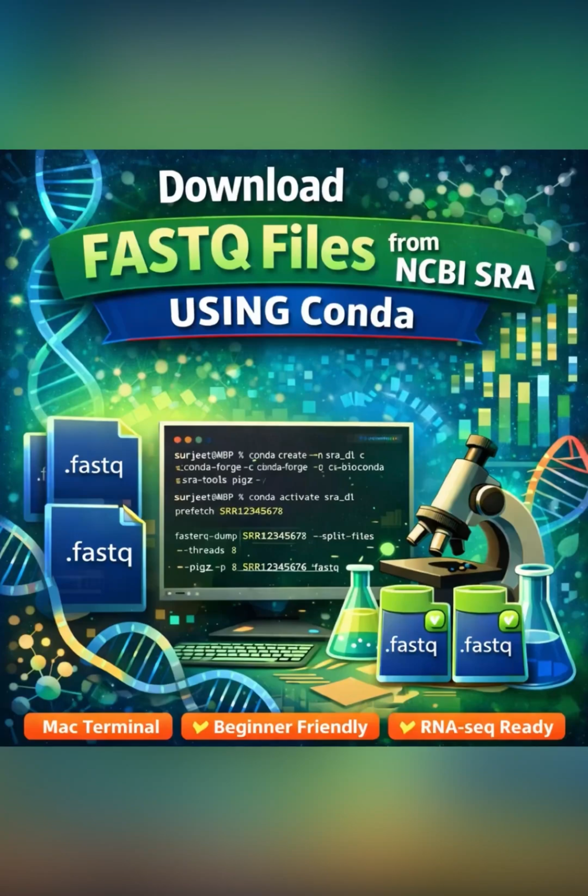Hi everyone, welcome back. In this video, I will show you how to download FASTQ files from NCBI using Conda, step by step, in a very simple way. Let's go one by one.